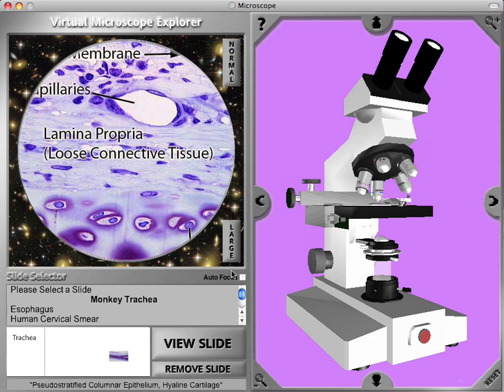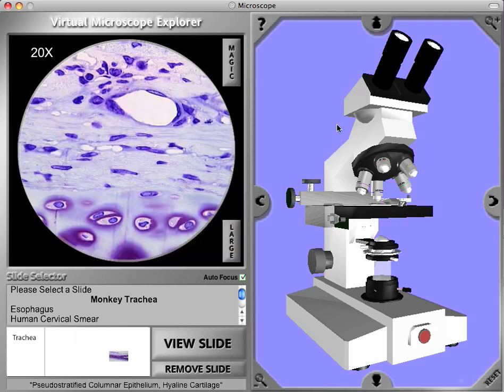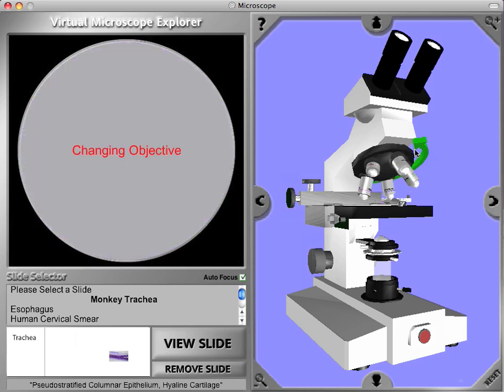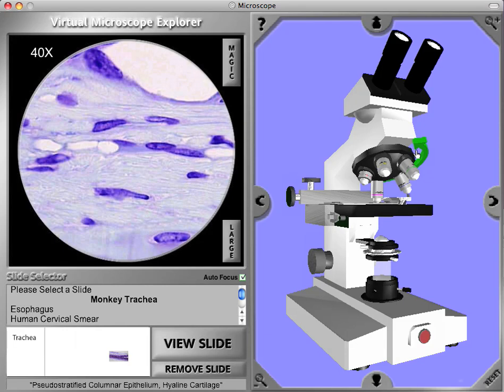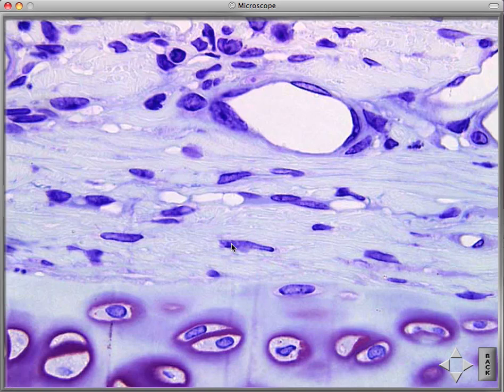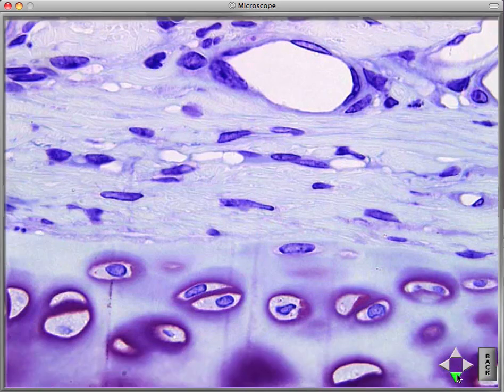We have an autofocus feature that we can click so we don't have to focus between each magnification objective. Let's look at the 40x magnification objective image — we click on the right side of the objective holder and it rotates to the 40x objective. Then we can click 'Large' and see the whole image for this specimen.